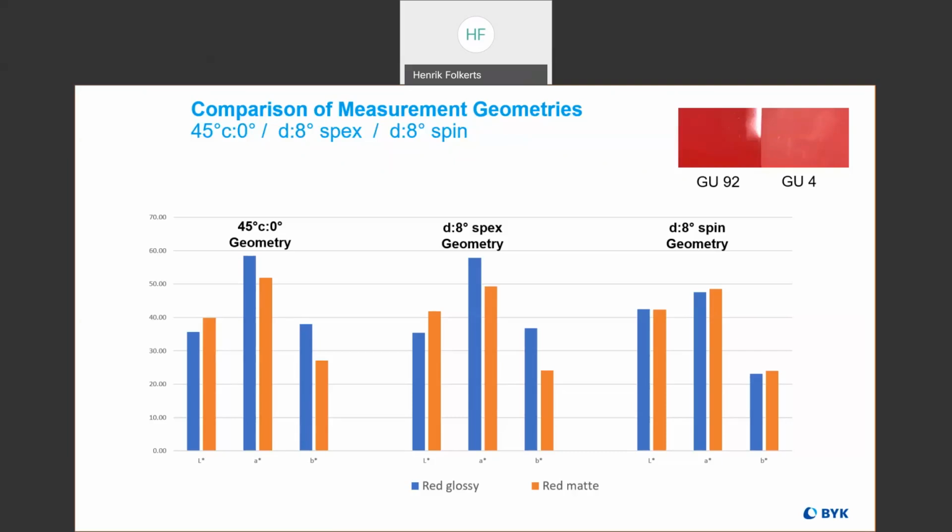By design, multi-angle spectros have a directional light source, meaning it does not have circumferential illumination like the 45-0 does. The reason for that is those products that you're typically going to use the instrument on are most often seen outside under daylight, and even if they're inside, the light's pretty much always going to be coming from overhead.